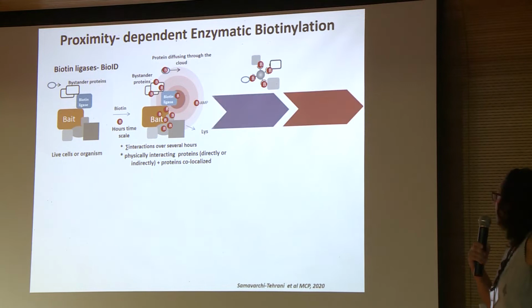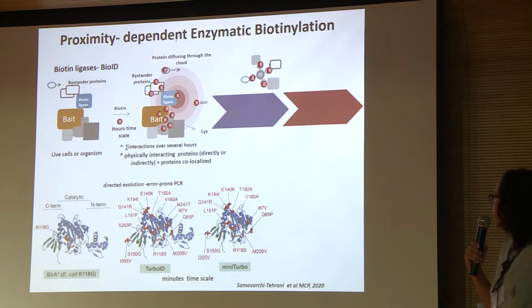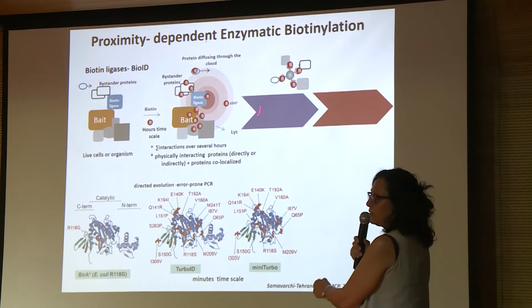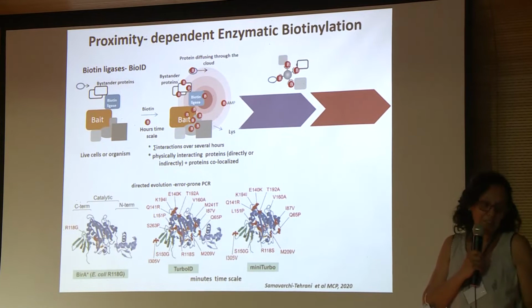So after, we are not seeing the whole thing seems to have a problem. Doesn't matter. I will just say that after that, we can make something that should be here is a affinity purification based on biotin and MSMS analysis. No, you can see it here, but not there. I don't know which is the problem. Okay.